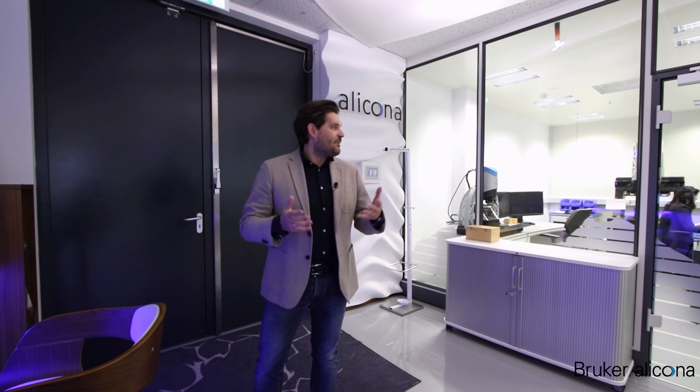Welcome to the next episode of our vlog series. Some vlogs ago we explained in detail the focus variation technology and the add-on of vertical focus probing. This game-changing technology we will explain today directly on several applications. I am invited today into the Applications Technology Center and Lucas is already waiting for us. Let's go and have a look at the first application.